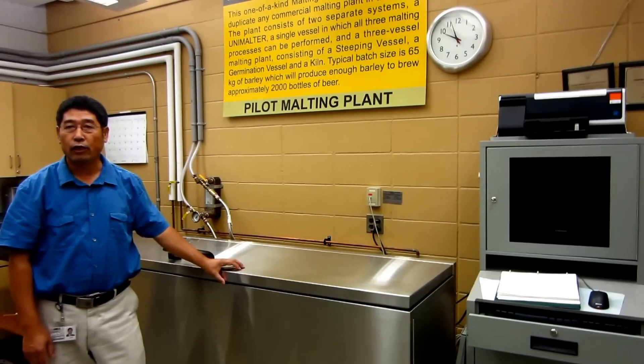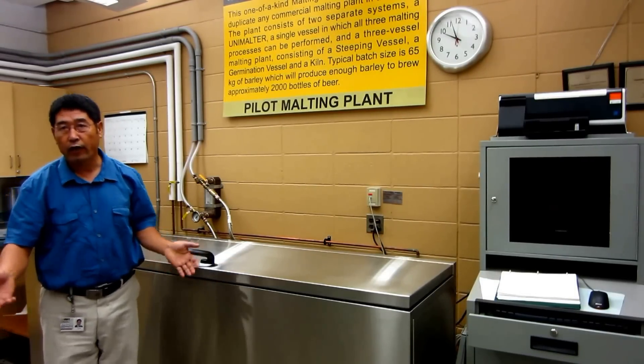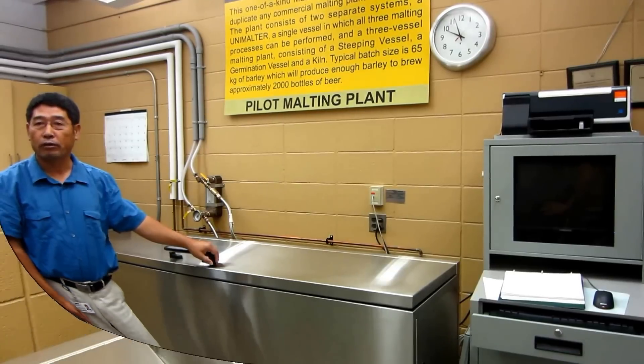In addition to that, we also use it to evaluate new crop barley samples. Every year during harvest, we will get new barley samples, and we would like to assess the quality and the malting potential.